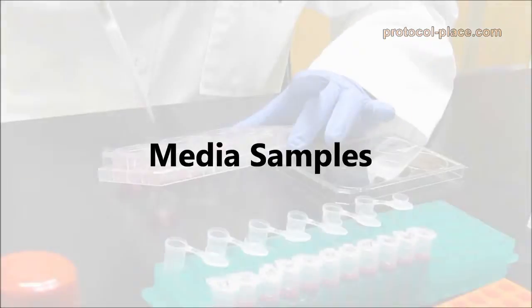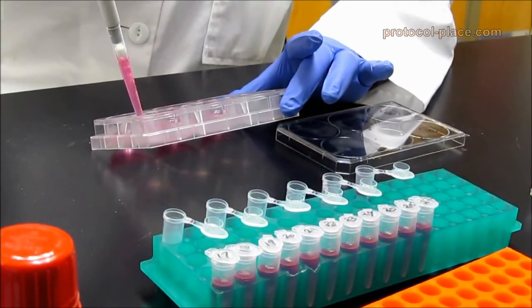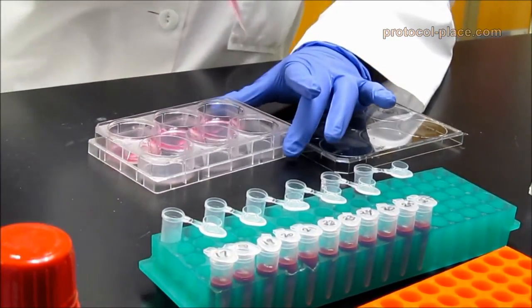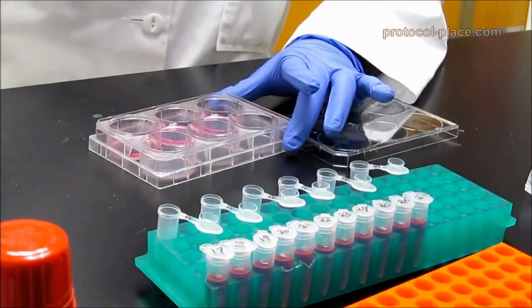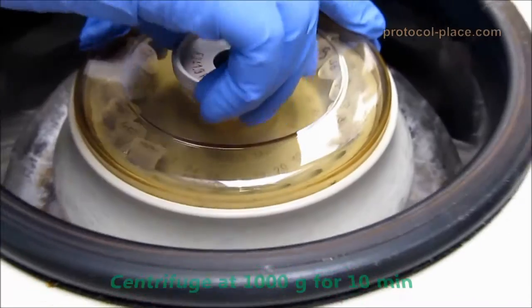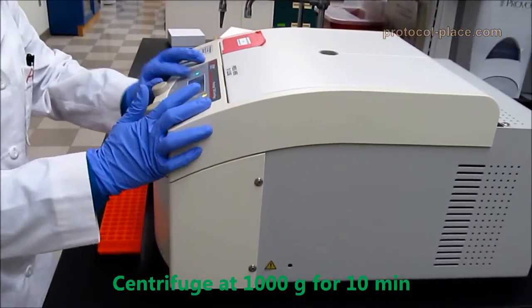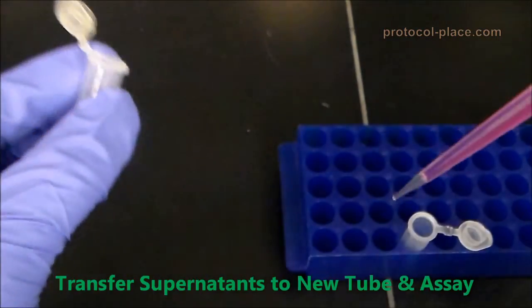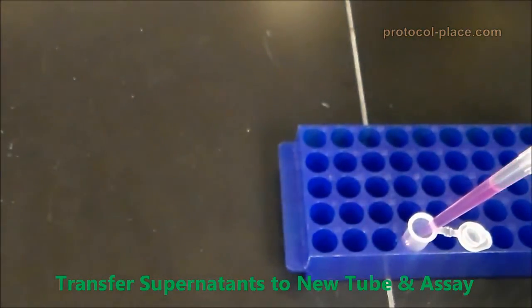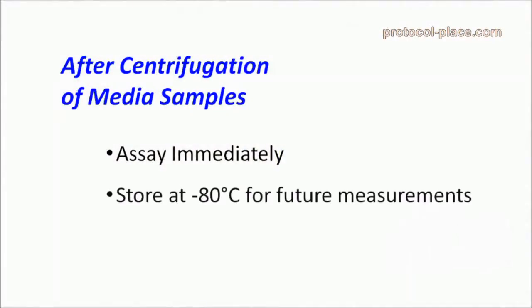Media samples are the most straightforward to collect. Simply remove the media from your cell culture samples and transfer it to an Eppendorf tube. Then, centrifuge the tubes at 1000 g for 10 minutes in order to pellet any cellular debris. The supernatants can be transferred to a new tube and assayed immediately, or they can be stored at negative 80 degrees Celsius for future measurements.